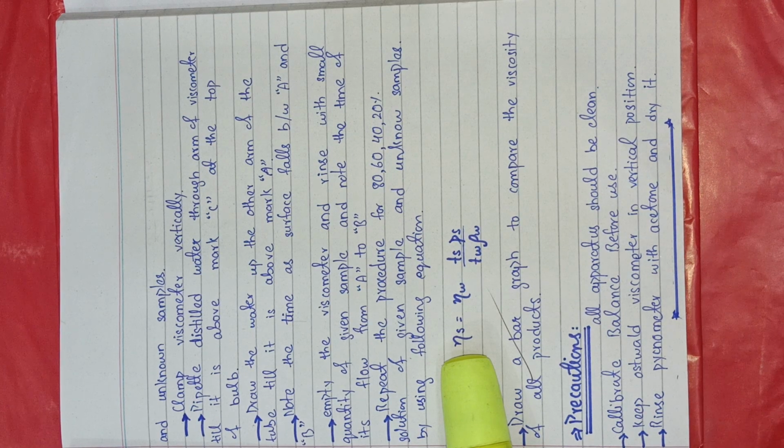So then you fill it and again note the time when this product moves from A to B. By comparing this time you will find the viscosity of that substance.